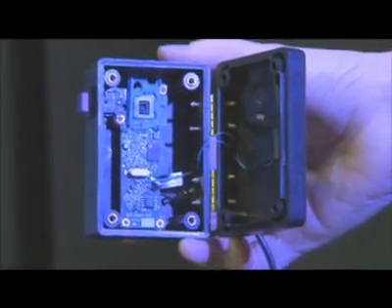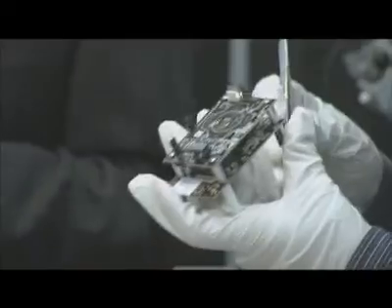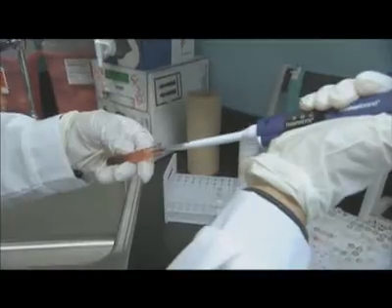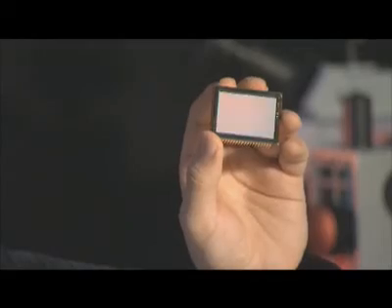"So I had that idea that I want to use just the sensor array itself. Of course, I was very excited, but then I had to test it." First, Ozcan removed the protective cover of a regular digital camera chip. Then he placed cell samples directly on the camera's sensor, which is made up of an array of millions of pixels, each of which is sensitive to light, just like our own eyes. He immediately saw the cell's shadows. "So that was a remarkable moment that I said, yes, it's going to work."